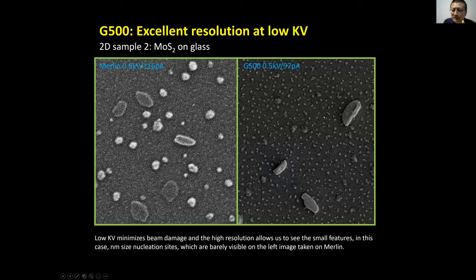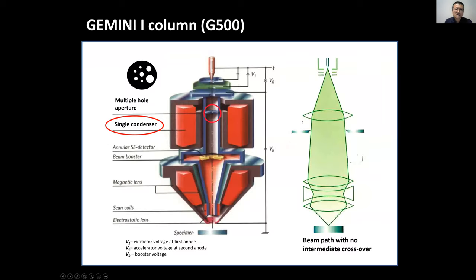Let's compare Merlin and G500 for low kV imaging of 2D material. Merlin's image is not that good — a bit noisy. G500 does a really good job imaging 2D material at low kV. Why? It depends on the column design. G500 uses the Gemini column — inside you have a condenser and objective lens. Merlin has two condensers, G500 has only one condenser, but it's optimized for low kV.